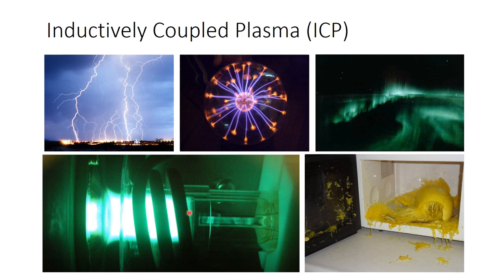And as the temperature increases, in this case the temperature is almost 6,000 Kelvin, so this is as hot as the surface of the sun. This extreme high temperature causes everything in this region to be ionized. Okay? And then what happens is, in this tube in the middle here, we basically spray a mixture of gas and sample particles, so an aerosol of samples, into this region here, and that causes our samples to be ionized.